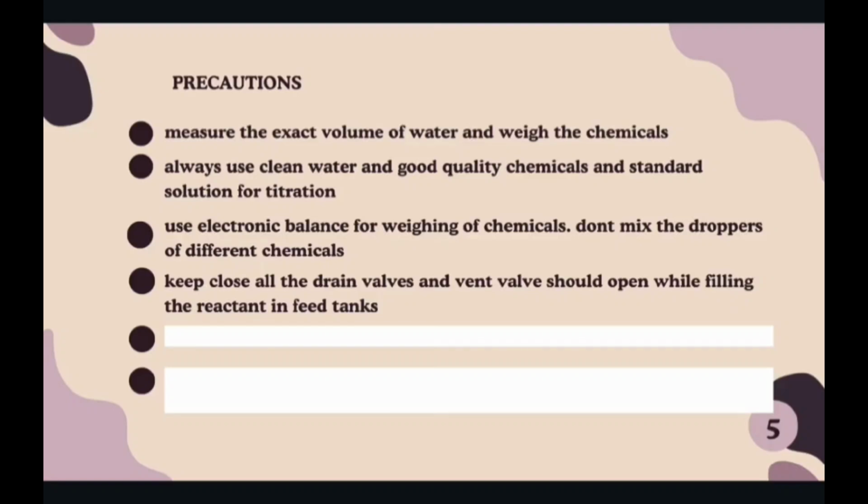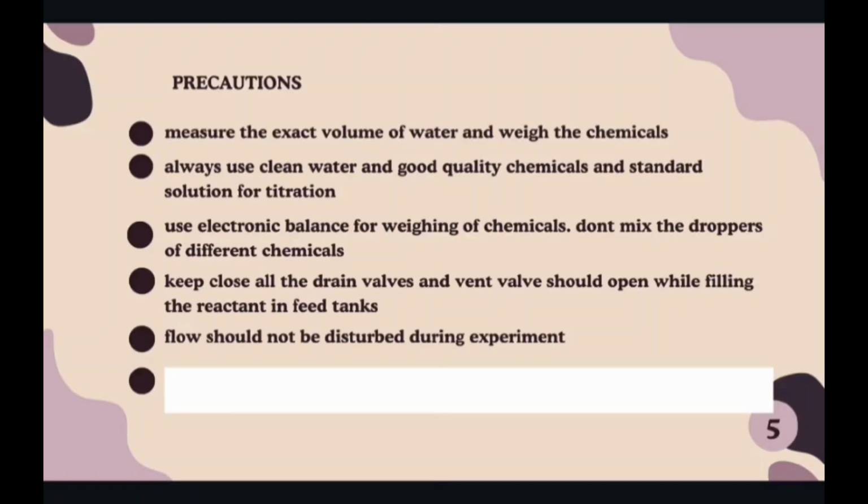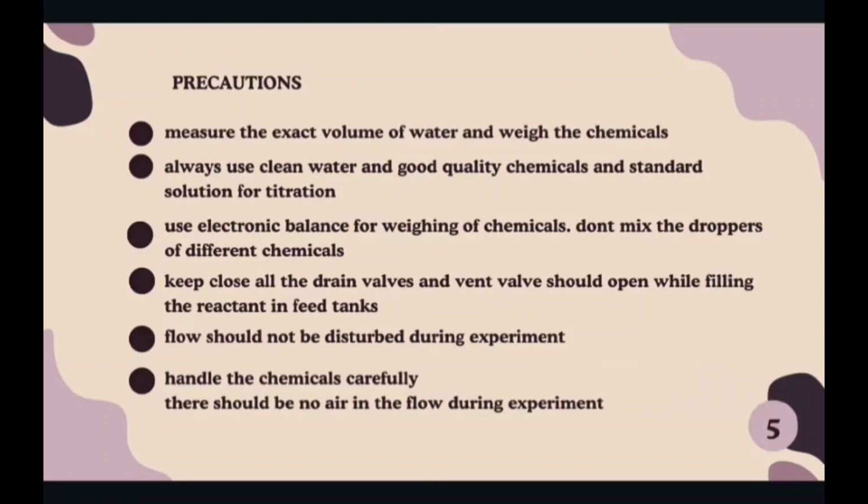Keep all the drain valves closed, and the vent valves should be open while filling the reactant in the feed tanks. Flow should not be disturbed during the experiment. Handle the chemicals carefully. There should be no air in the flow during the experiment.